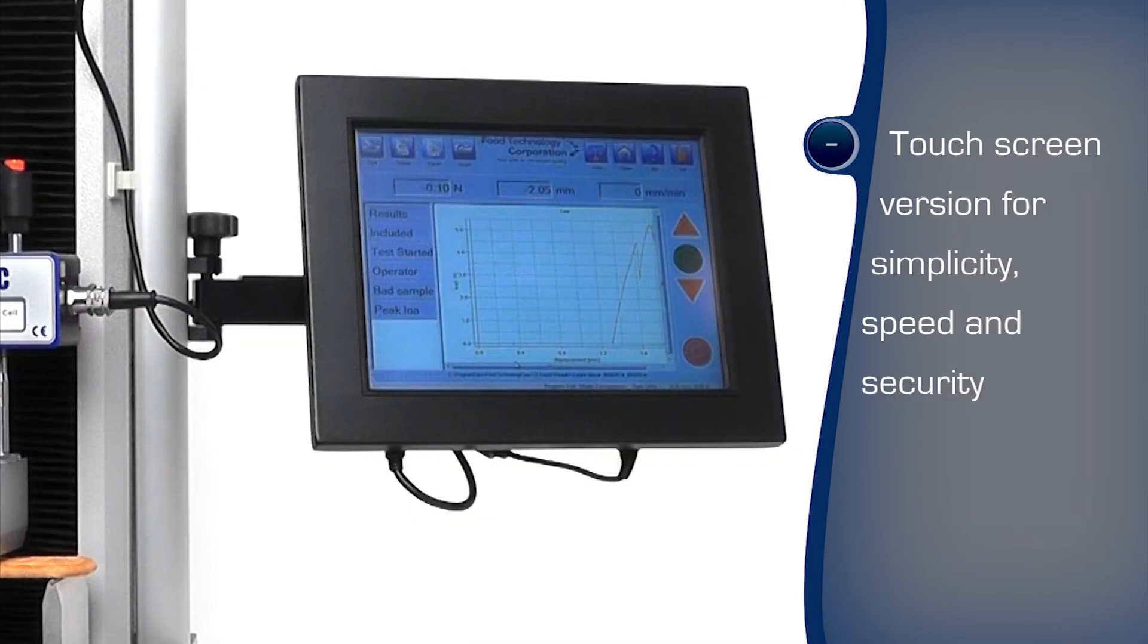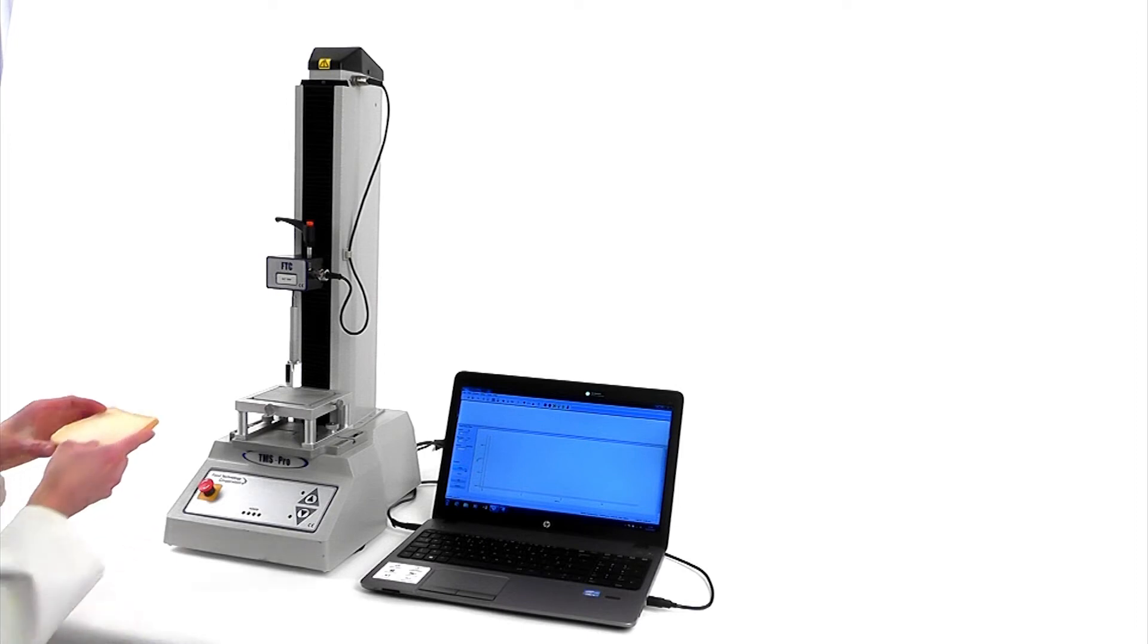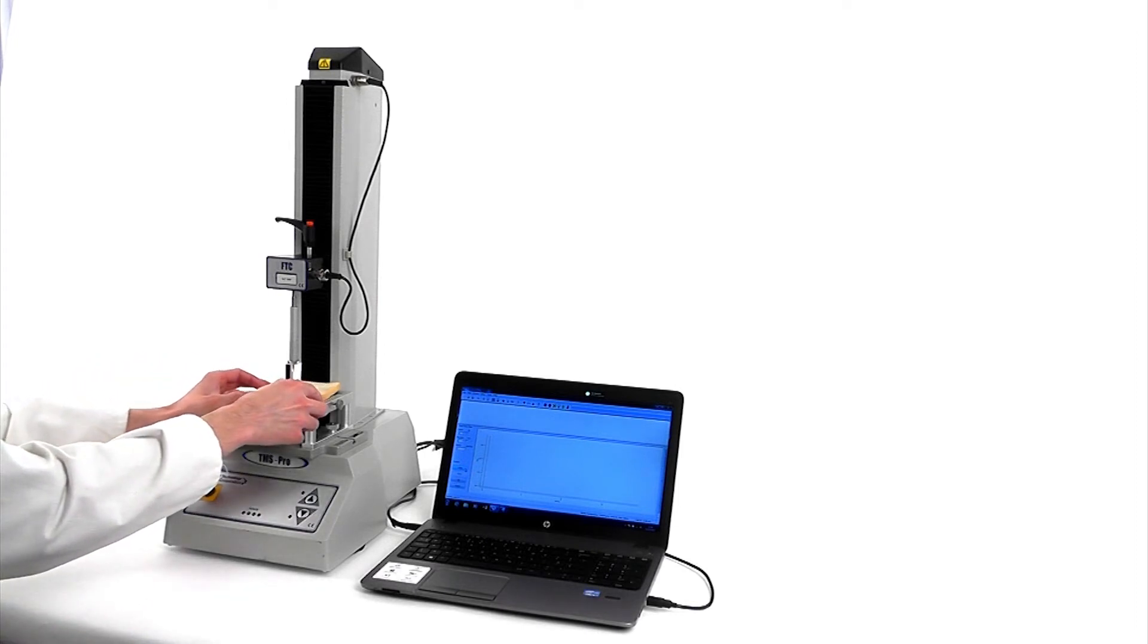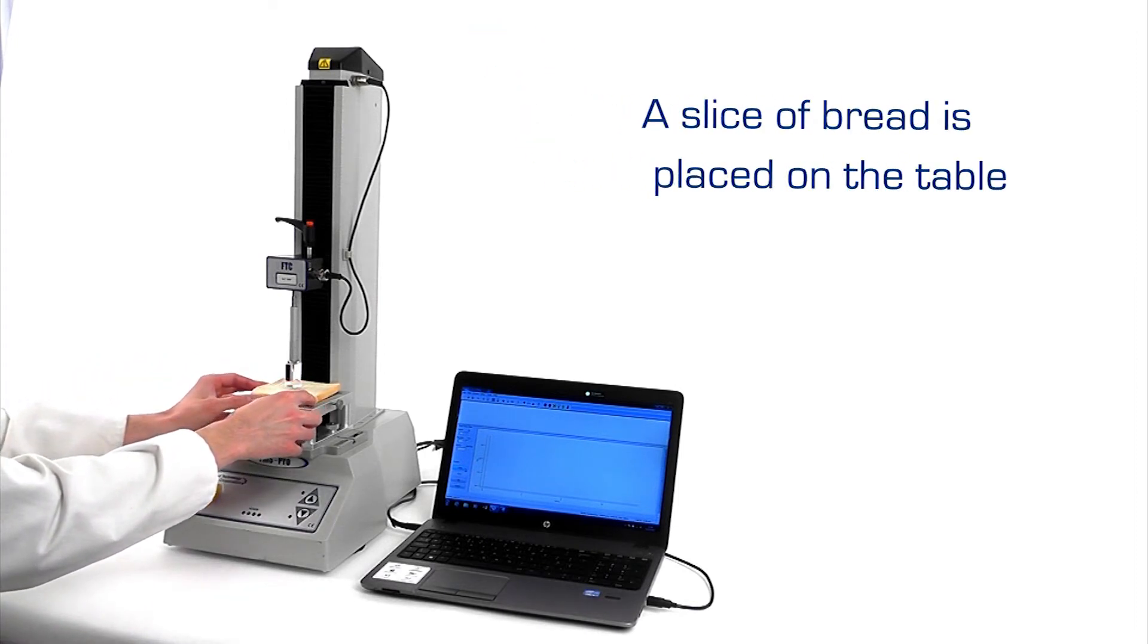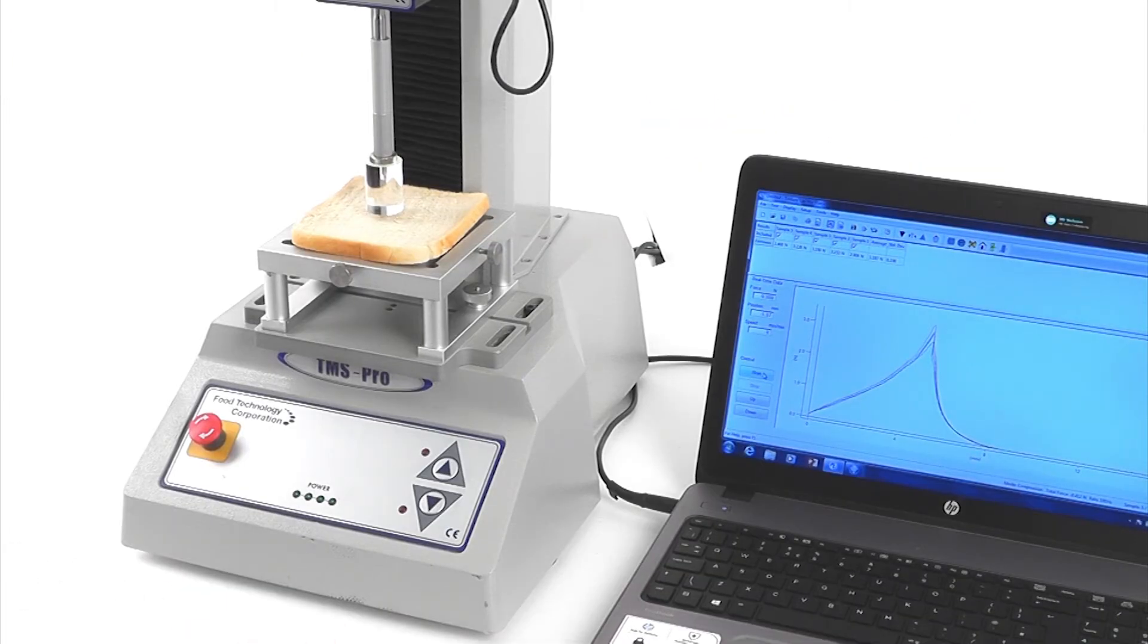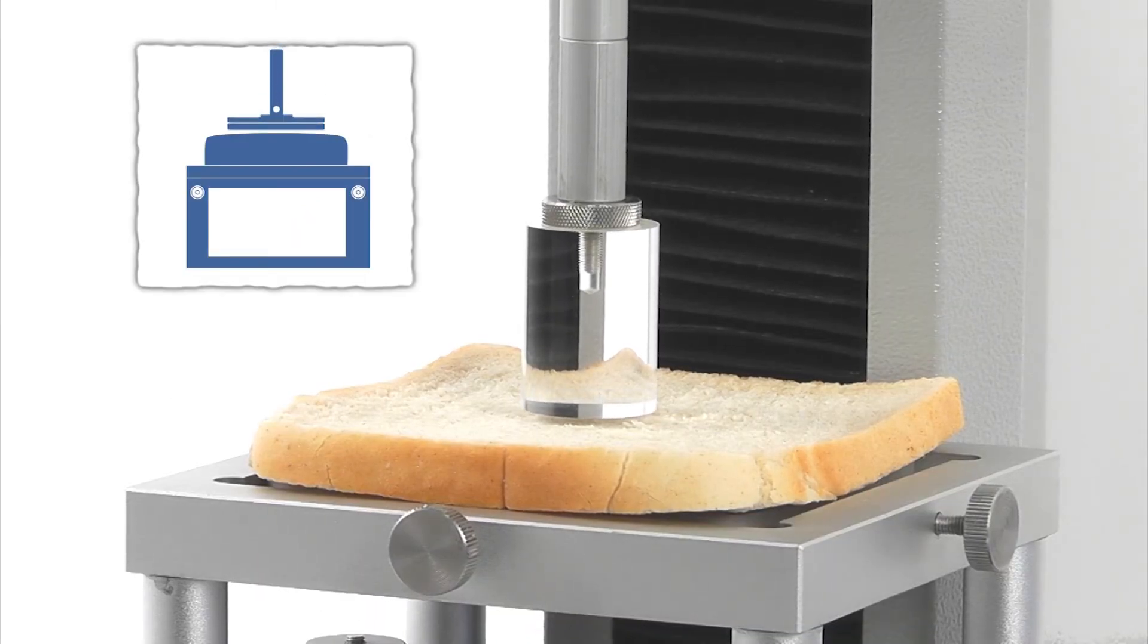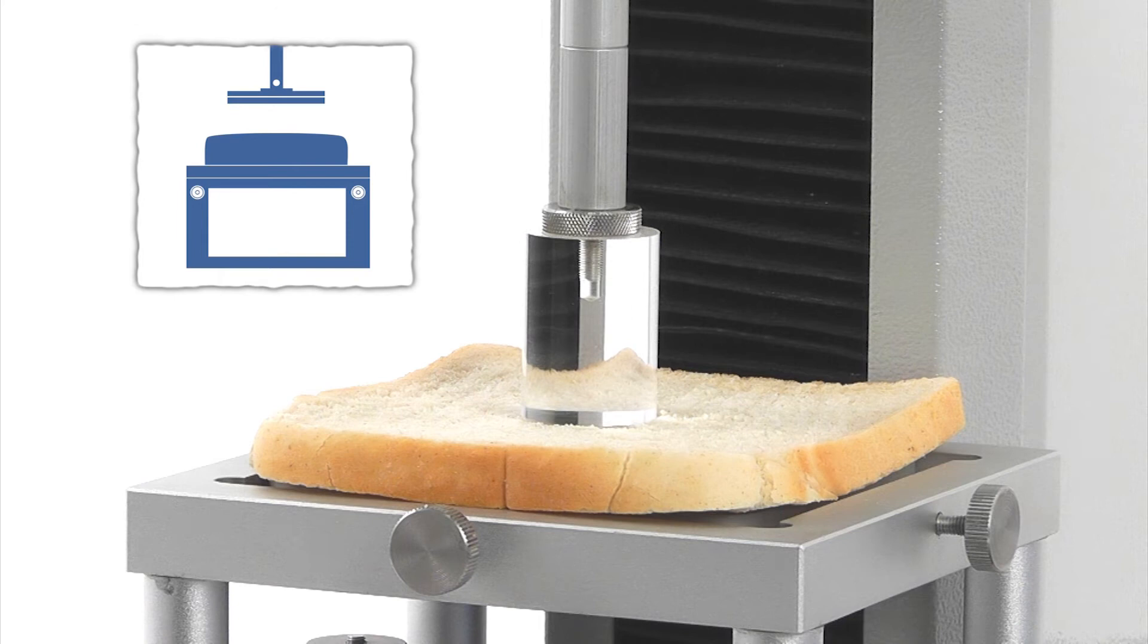The touch screen controlled texture analyser runs tests at the touch of a button with minimal training, ideal for production areas. The sample is placed on the flat, solid fixture table to preclude penetration or puncture. The test procedure will slowly move the probe to detect a touch on the bread, then move just a short distance further, more quickly, to compress it.